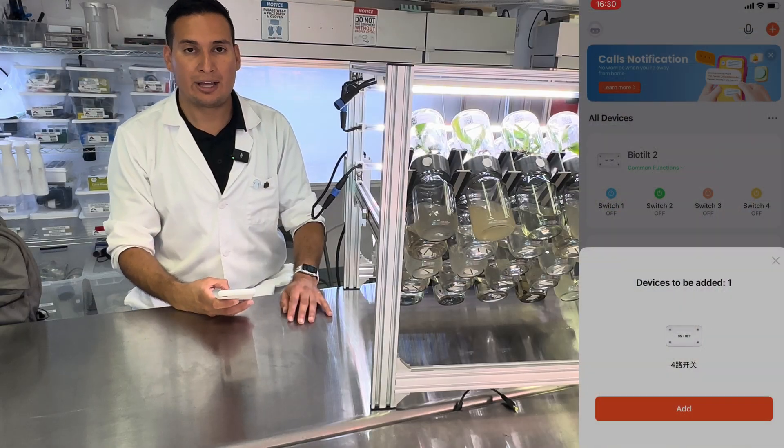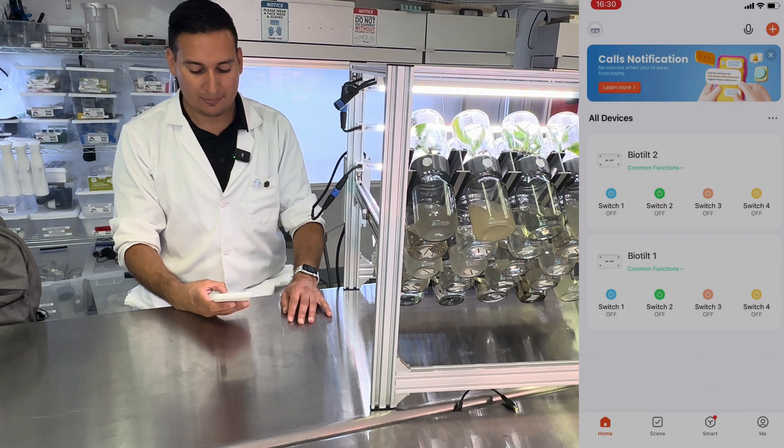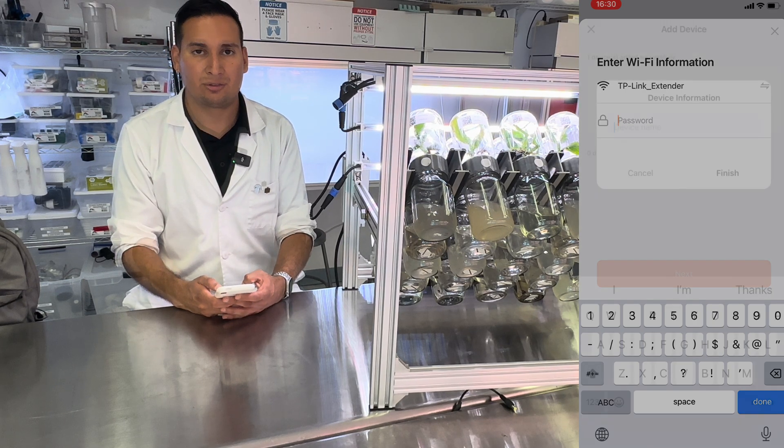The controller should automatically appear in the app. If not, you can just click the plus button to add the device. Then you need to connect to your Wi-Fi. Make sure you are connected to a 2.4 GHz connection.